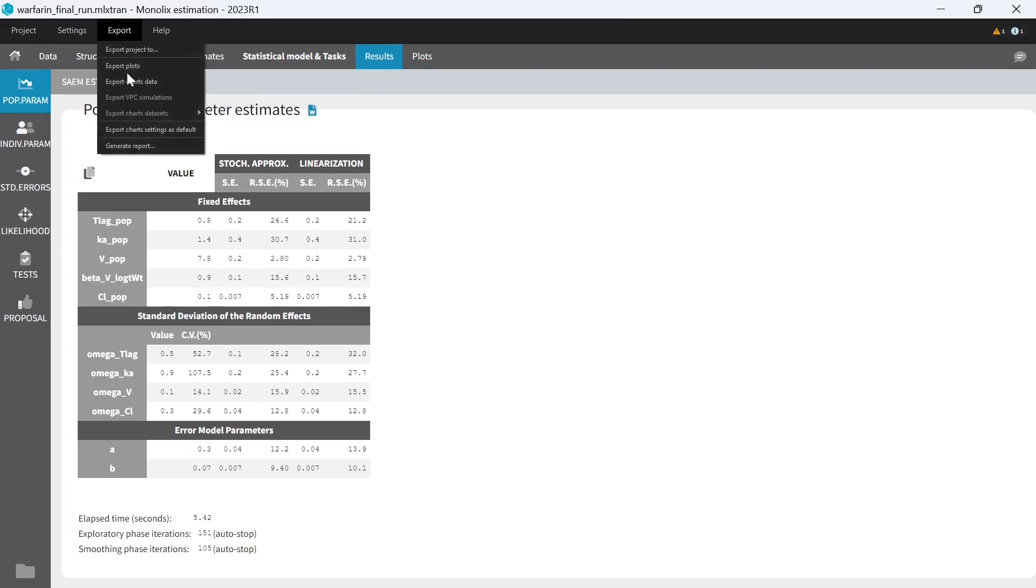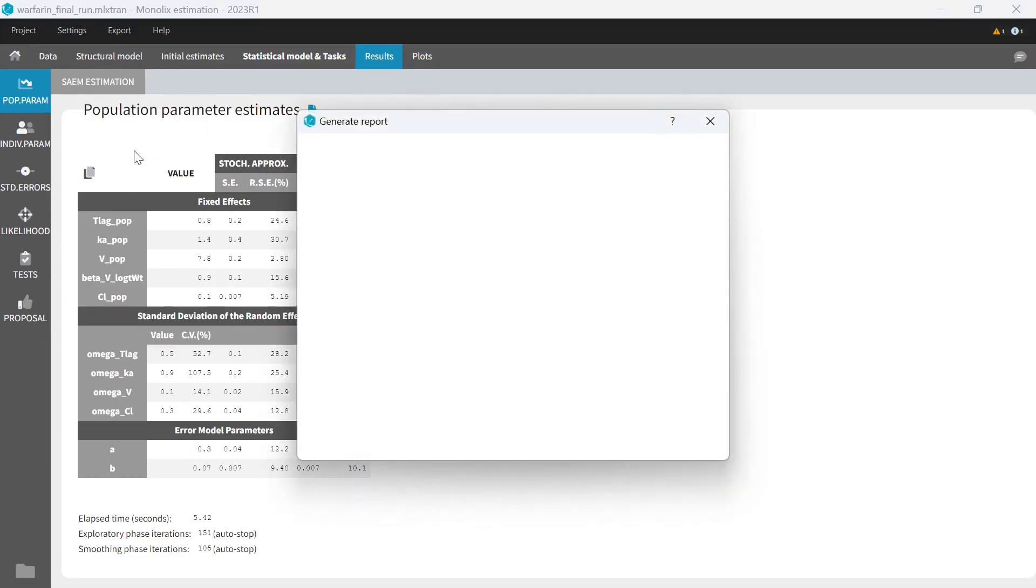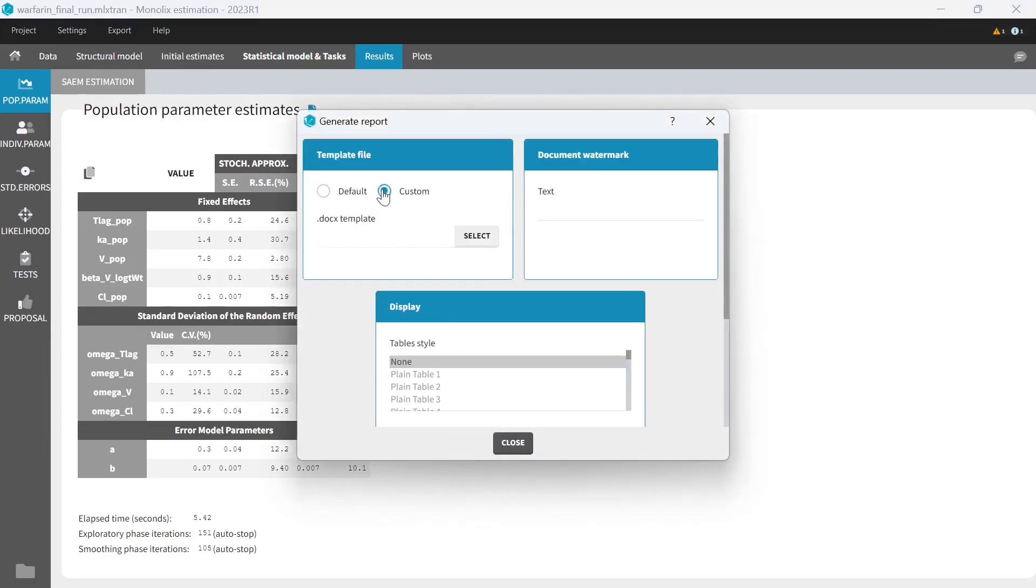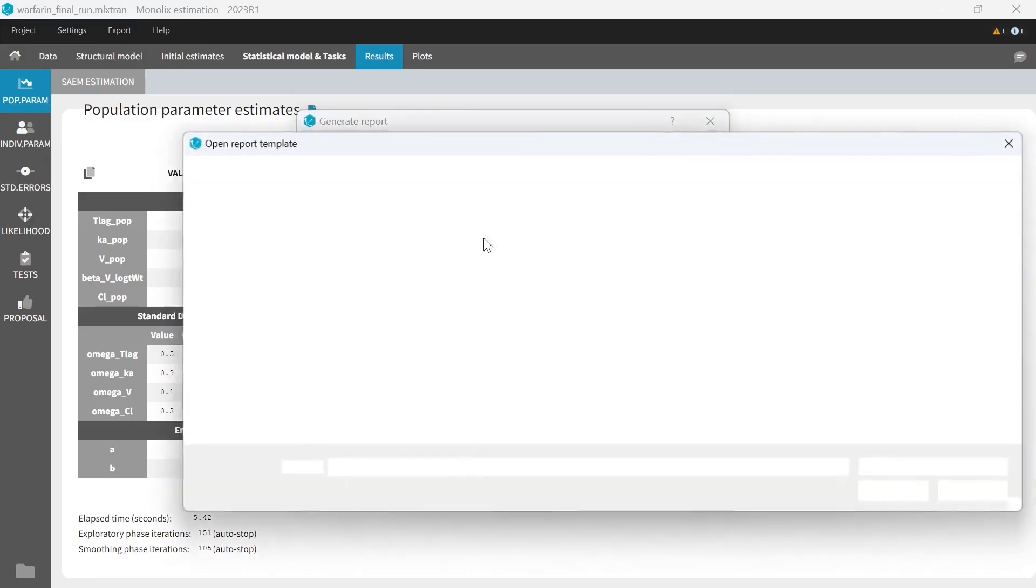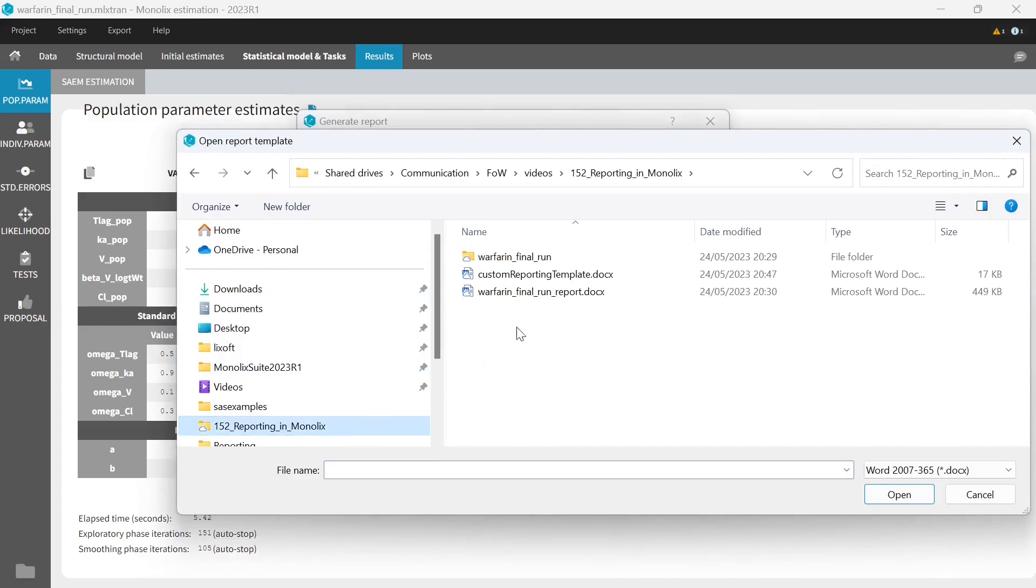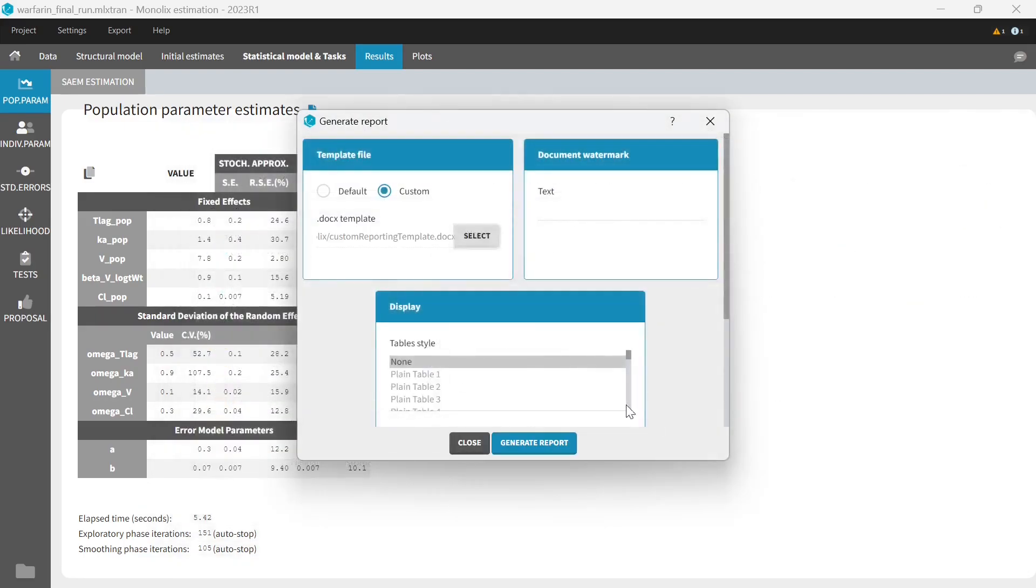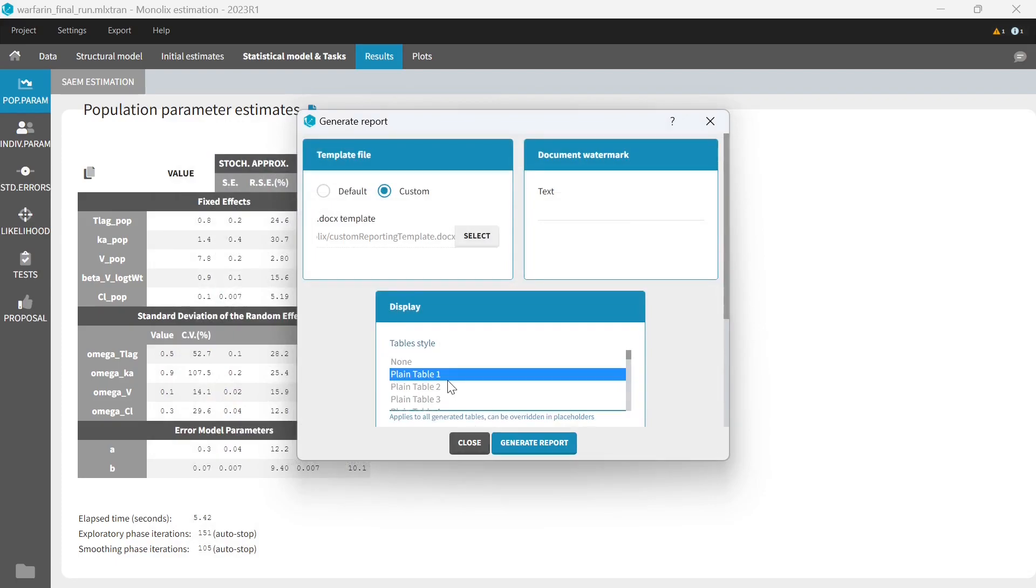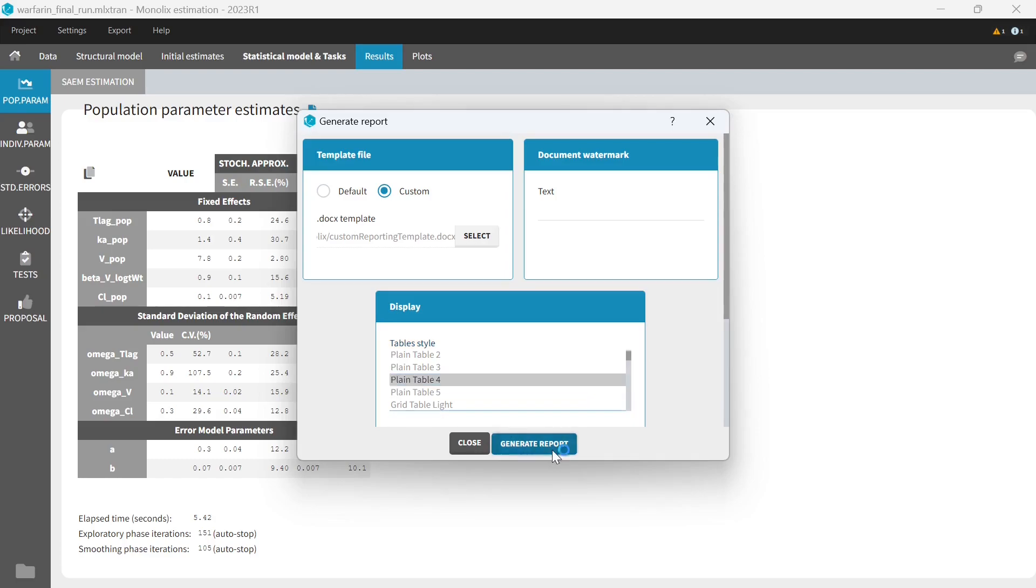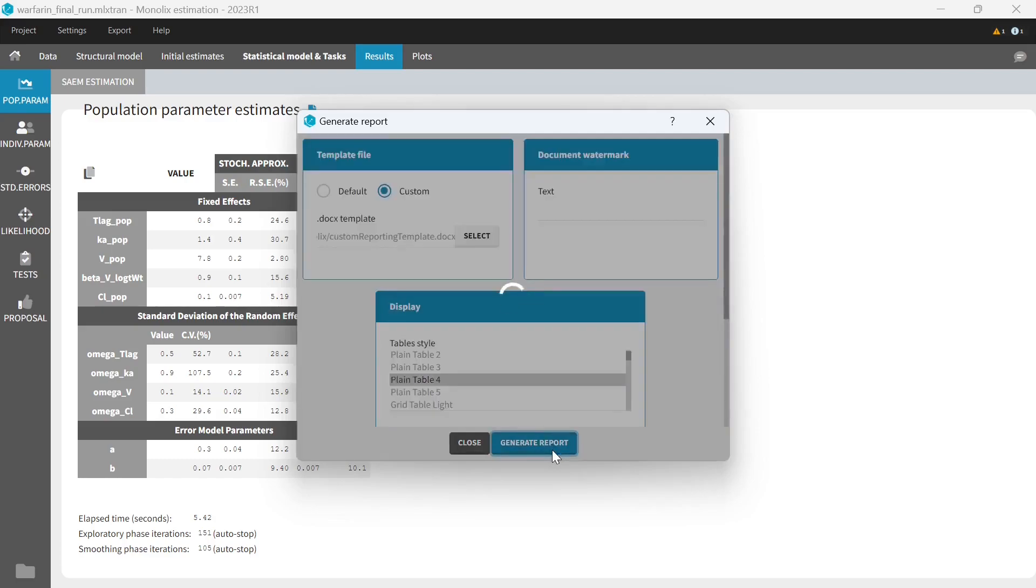So I'm going to generate a report again, and this time I select the custom option, and I select the template that I just created. I have this additional option to select some table style. The names that you can select here are the default styles in Microsoft Word, so I can choose, for example, plain table 4. It is also possible to use your own Word table styles inside the placeholders, if you always use the same style in your reports. I generate the custom reports now.